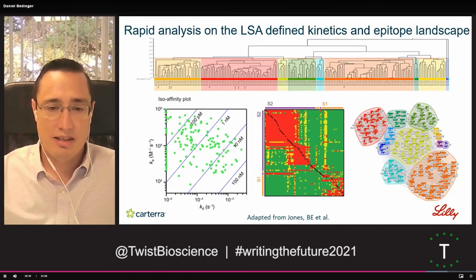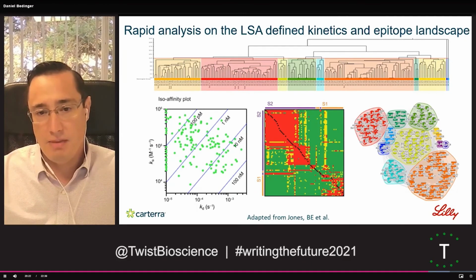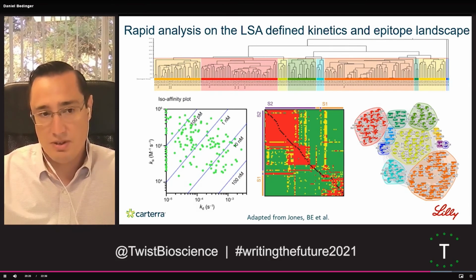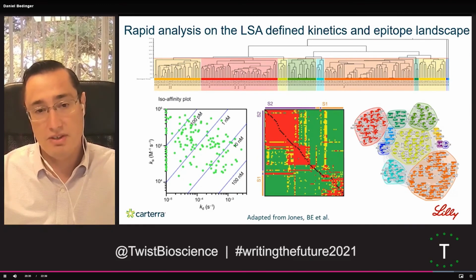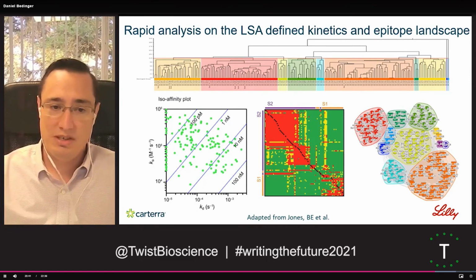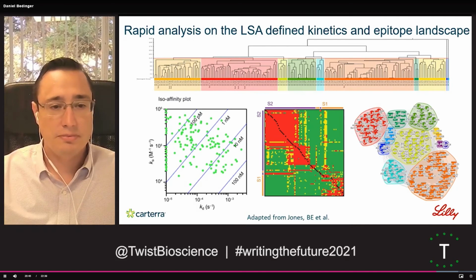Again, the SPR was heavily used in this rapid characterization phase with full kinetic profiling and full epitope binning, establishing which communities these clones of known sequence diversity went into, so they really understood the platform. I mean, the importance of the genetic diversity on the epitope binding and the affinity of the set allowed them to strategically down select into that limited number of clones.